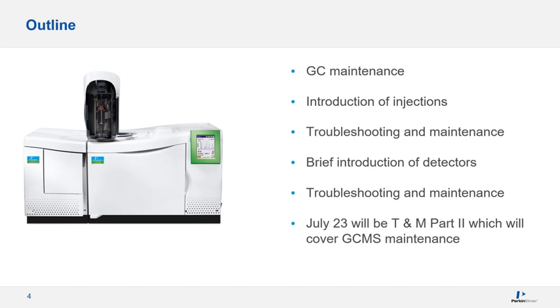I will be covering a brief introduction of injectors and troubleshooting and maintenance, a brief introduction of detectors, troubleshooting and maintenance. We will go into column troubleshooting and maintenance in minimal detail because we have a course in the fall semester totally dedicated to columns. Some of it is relevant to be in this course as well. So I will move on to the presentation and again thank you.